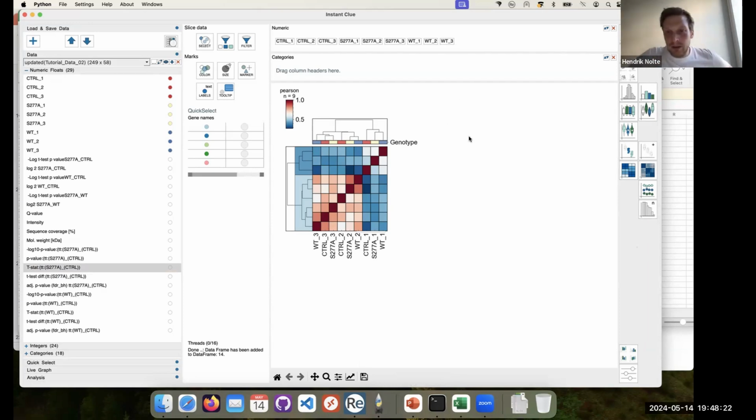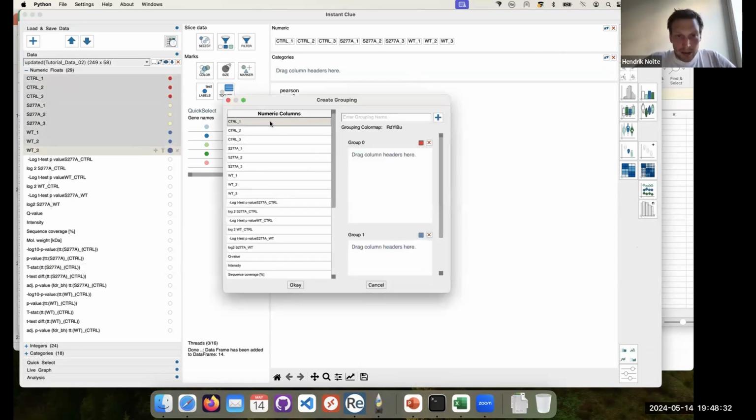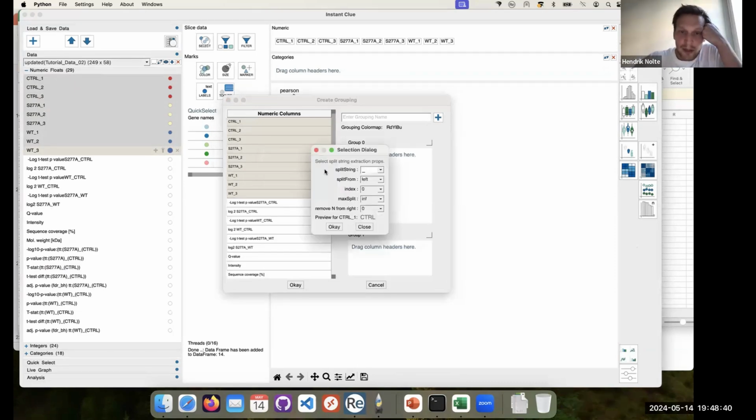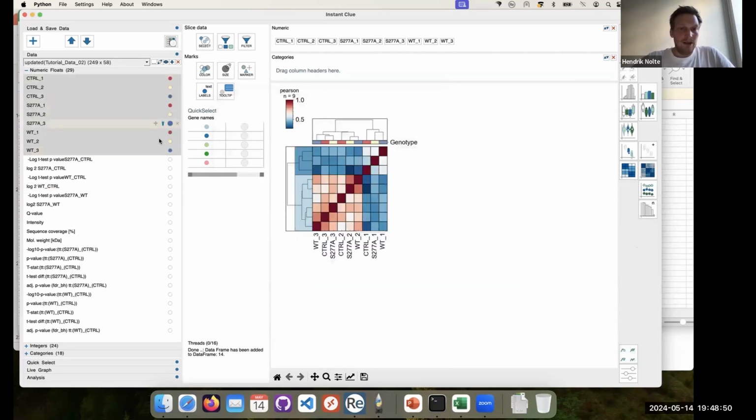Yeah, so there's a question if you can do the grouping of 2. So you can add as many as you want to. Let's say, just for the sake of example, we add now a replicate group, which would be identical to just having another one like diet or so. So in this case, we are not taking the first index, but the second one, which is called 1. And then you get 1, 2, 3, 4, 5. Let's call it, for the question, diet. And then you get the annotation here.